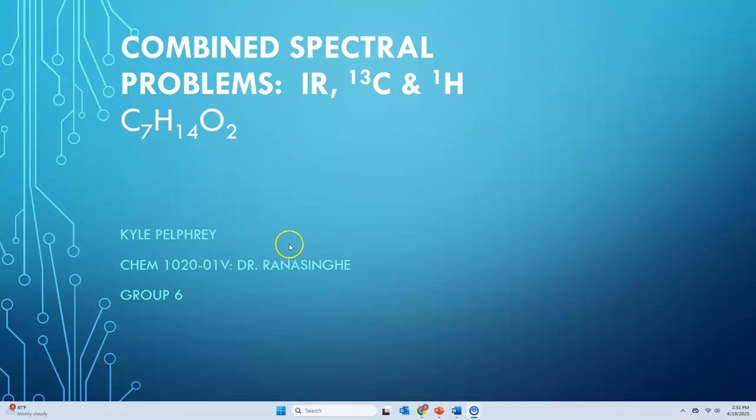My name is Kyle Pelphrey, and in this presentation I will be showing how to work this combined spectral problem for the molecule C7H14O2. We will do this by using infrared spectroscopy, carbon-13 nuclear magnetic resonance, and proton nuclear magnetic resonance.